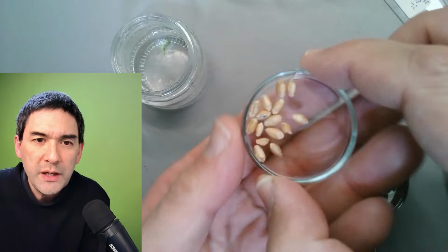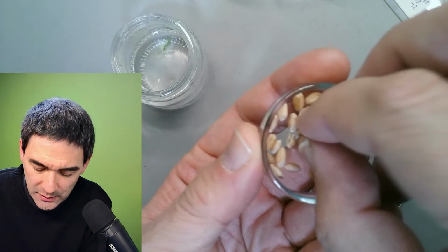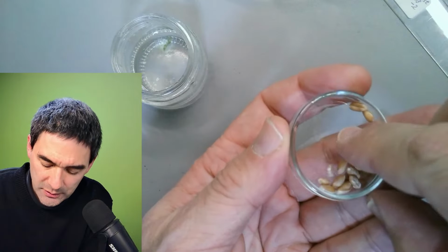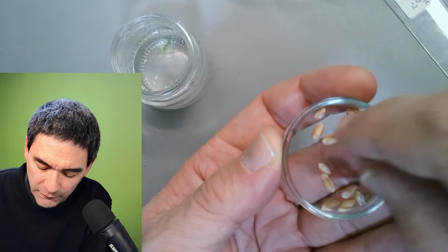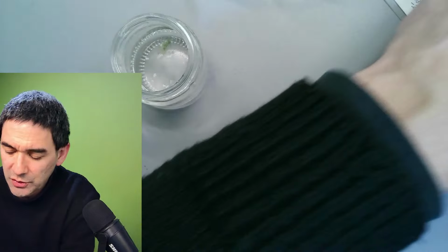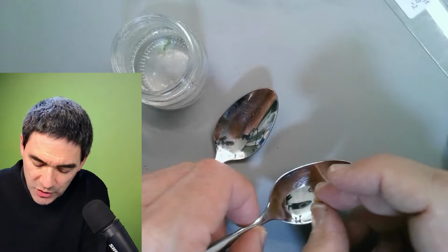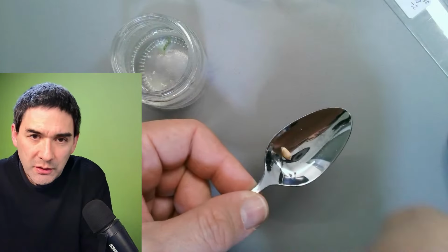These are wheat grains, cereal, basically whole wheat grains. And you just basically need 1 or 2 of those. And basically this works far better than, for example, other cereals, because sometimes I just used regular oats, which is pretty much the same, but this works better, for stability, because they're kind of more solid.